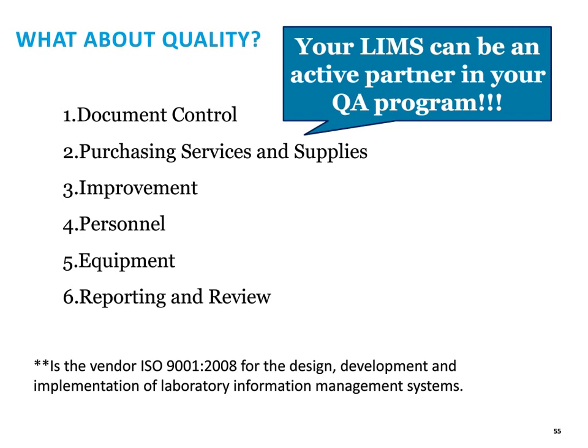For example, document control. If I can upload my training manuals and my SOPs into my LIMS and link them to the analyses, if I have a new examiner working in a unit and either it's a new examiner or maybe we've changed a procedure, if the analyst needs to view that SOP, why go to a separate system? Instead, while they're there conducting the analysis, it would be great if they could just click a button and view that SOP already stored within the LIMS.